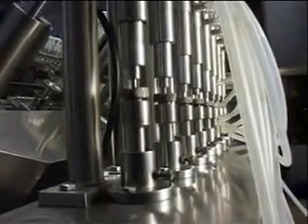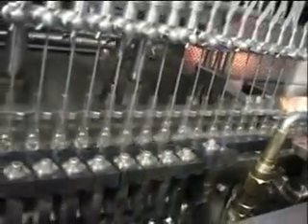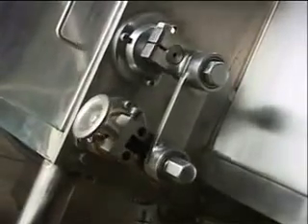Filled and sealed ampules are collected automatically in an erect position on SS trays without any hand touch. Accurate volumes can be adjusted by cam-operated 8 numbers of SS syringe pumps connected by flexible sterilizable tubing at the suction end to a sterile liquid source and at the release end with SS filling needles. A single volume adjustment slide is provided to ensure adjustment of all 8 SS syringes at a time.